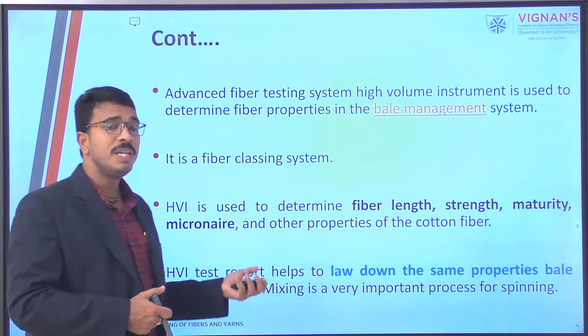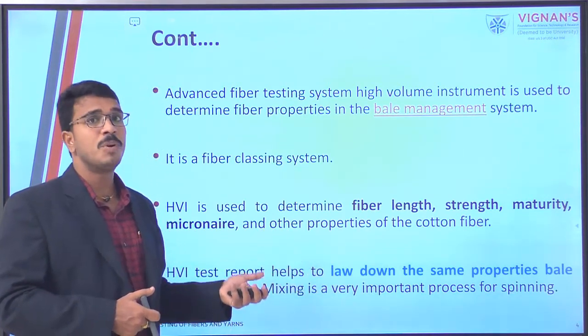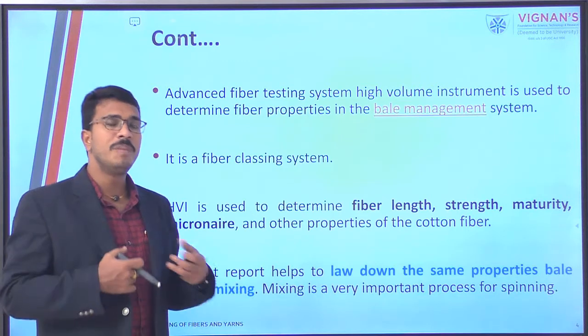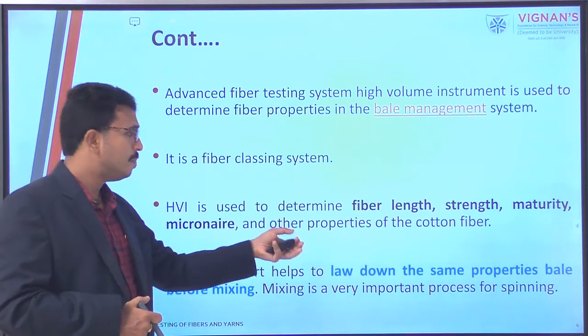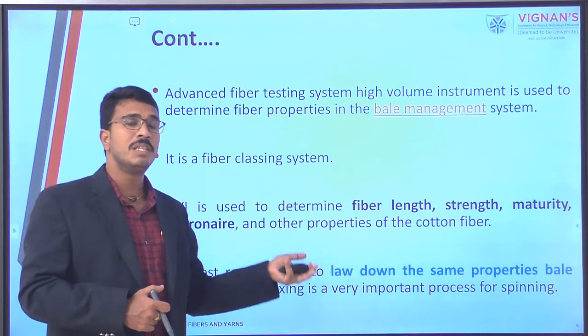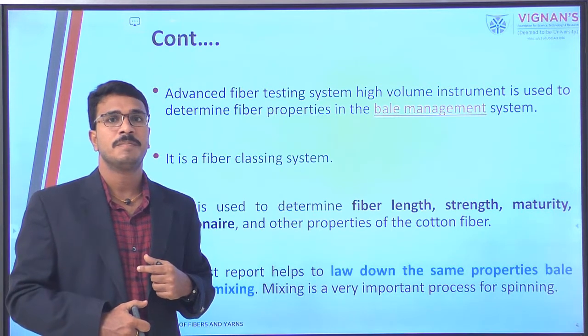And the HVI test report helps to lay down the same properties of the bale before mixing. And mixing, obviously, is a very, very crucial process in spinning.